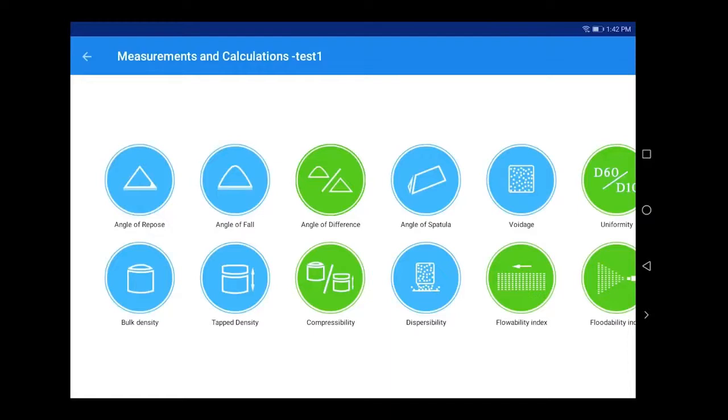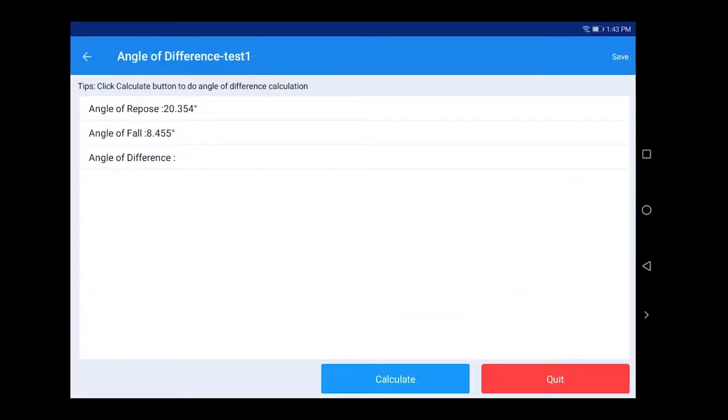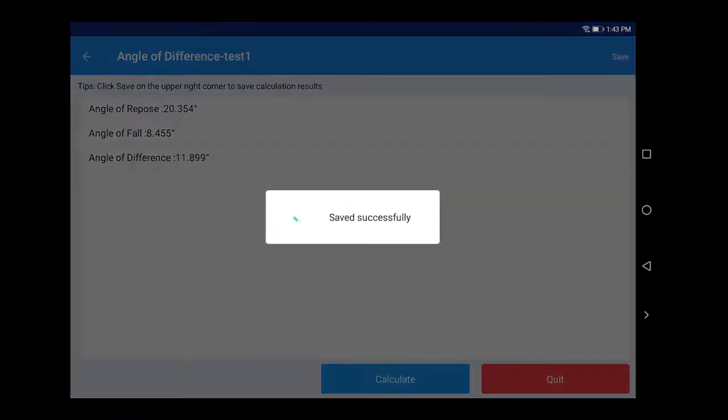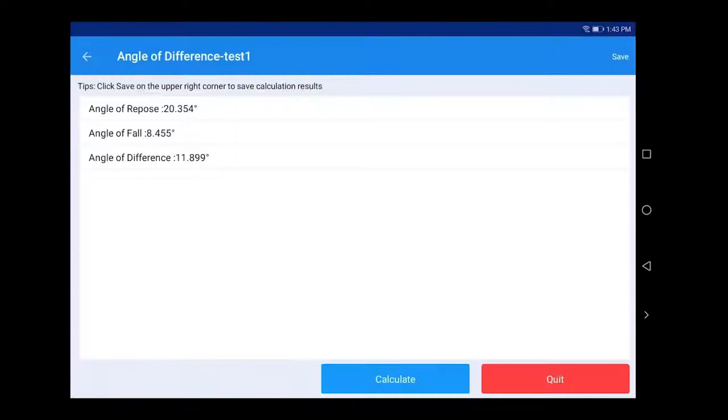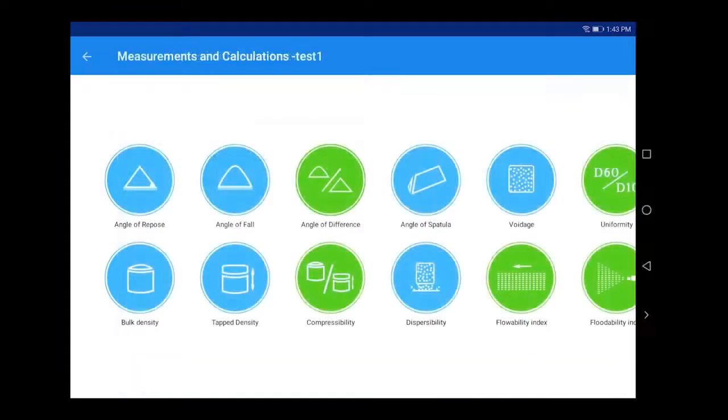For Angle of Difference calculation, click Angle of Difference. The results of angle of repose and angle of fall measured before will appear on the screen. Click Calculate and the system will automatically calculate the angle of difference. Click Save to save the results and click Quit to complete the angle of difference calculation.